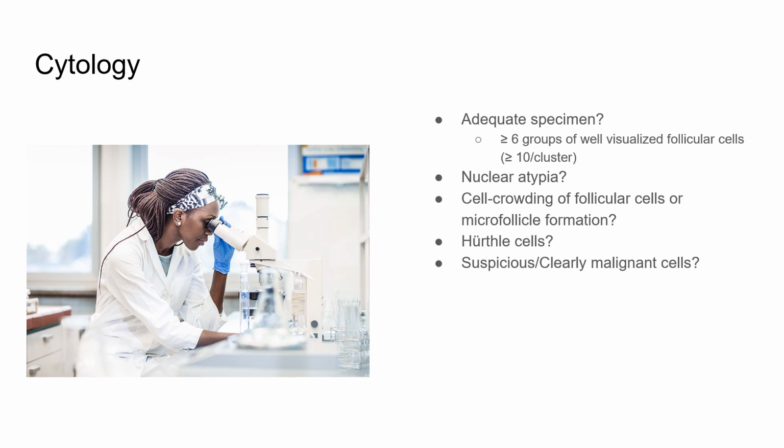So once cytology gets that specimen, whether radiology gives it to them or whether they're the ones actually taking the fine needle aspiration, there are a number of things that they're looking for under the microscope to tell them how to incorporate it into the Bethesda system, which I'll get into shortly, to be able to know what the diagnosis is and how to best manage the case.